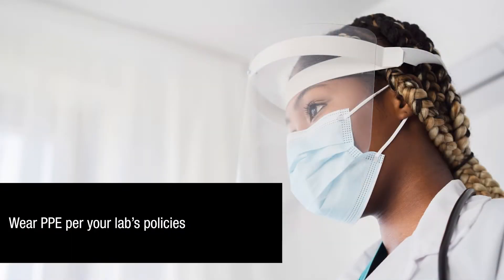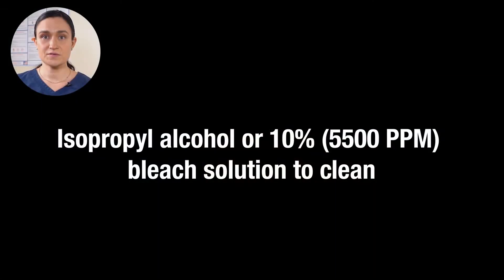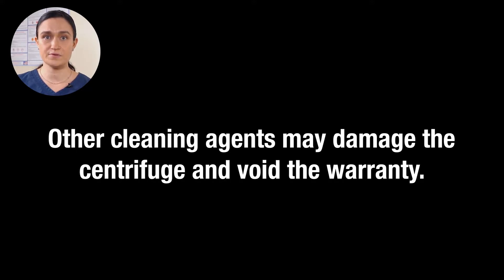Make sure to wear appropriate PPE in accordance with your lab's policies. Use isopropyl alcohol or 10% 5,500 ppm bleach solution to clean. Only these approved solutions should be used — any other substance may cause damage to your centrifuge and void the warranty.